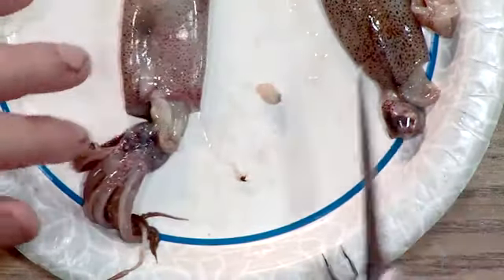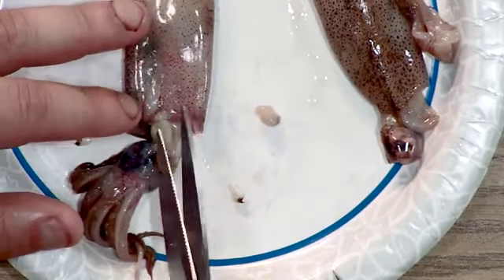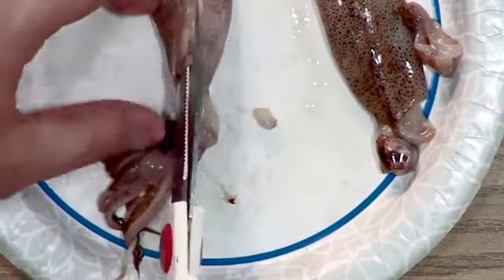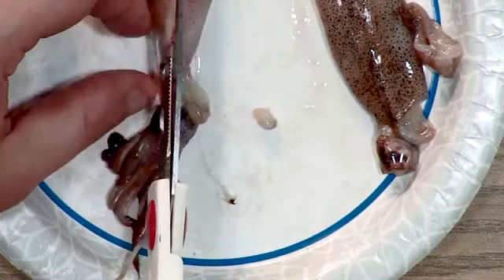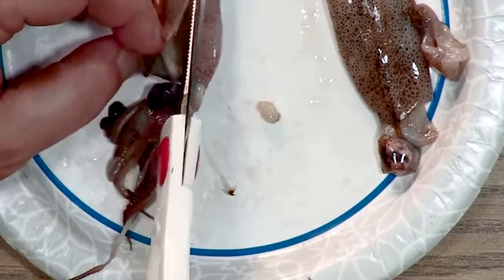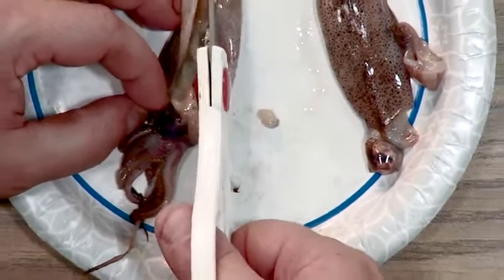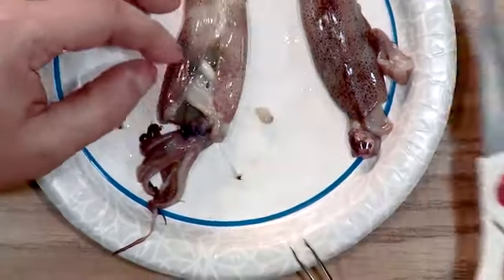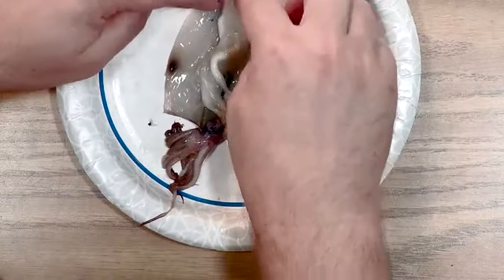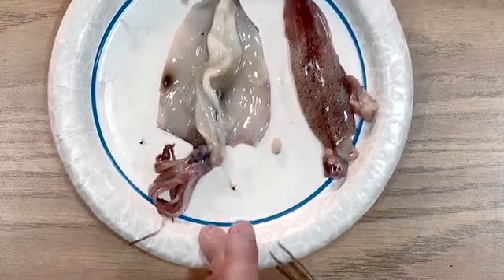So like I said, you want to look at the bottom, which is the lighter colored side. And I'm going to take my scissors here and put them inside and make sure that there's some spacing there. And I'm just going to cut all the way down to the tip. All right. Now, there's quite a few organs in this that are so small that we're not going to be able to even see them inside. But we do have a pretty good look at several things in here.